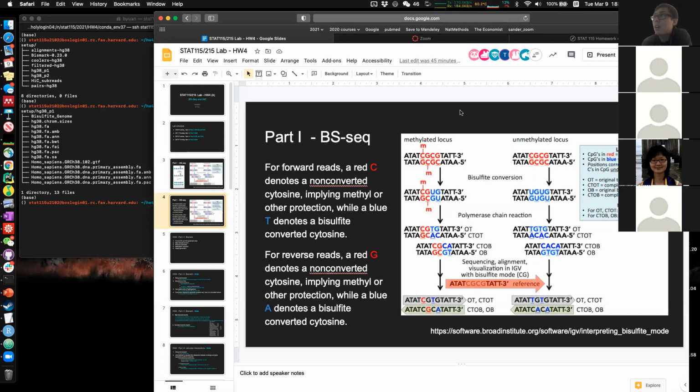Apparently, since we are going to change the genome, we are essentially also changing the reference, the background behind it. Whenever you do this conversion, you will not be able to realign your reads back to the standard genome, because in the standard genome, you wouldn't have such a fragment. You wouldn't have this sequence.